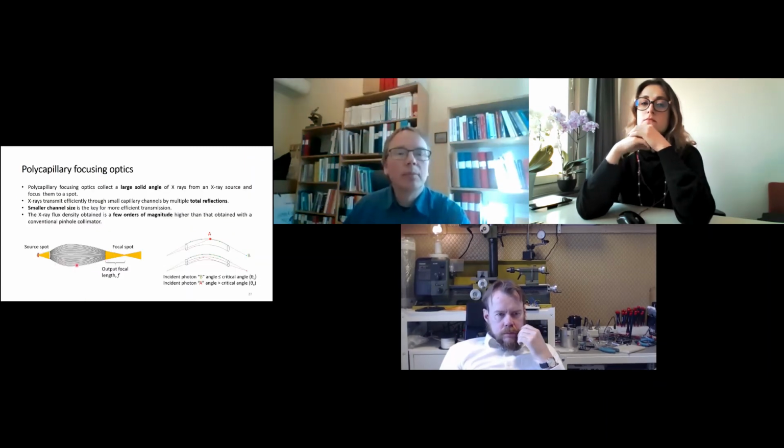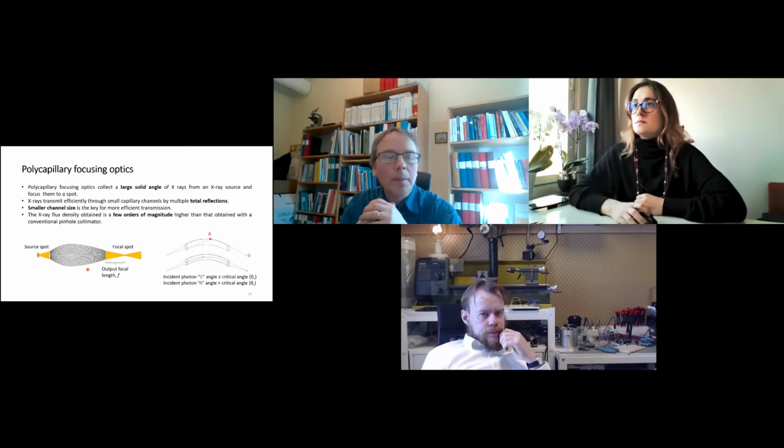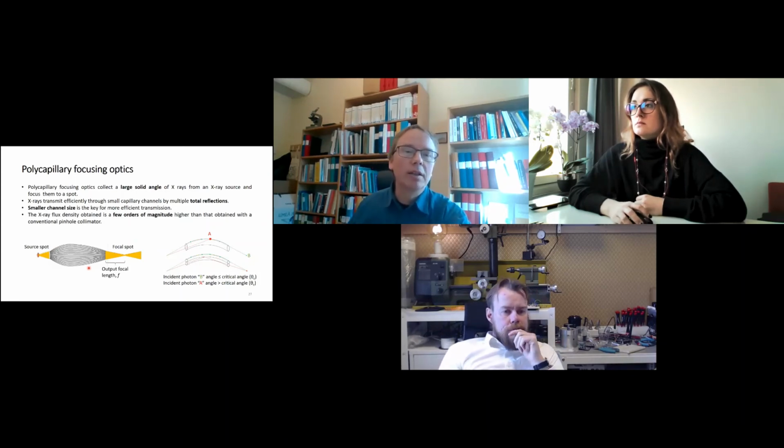So the next step will be to buy polycapillary focusing optics, where we use an X-ray lens to improve the spot and get it down to a resolution of 10 micrometers. That's what we're aiming for, and this is in the process of purchase.